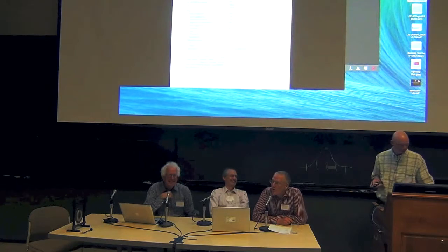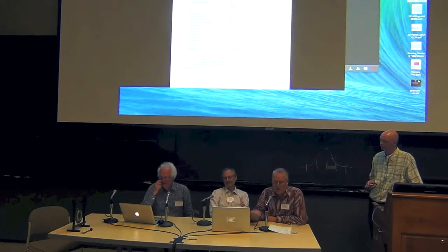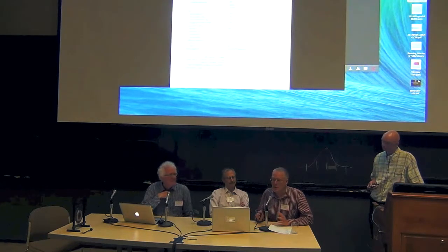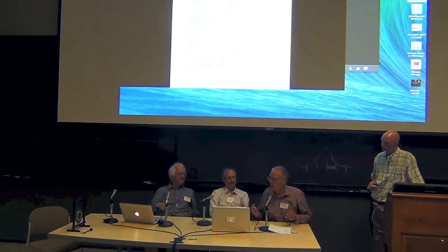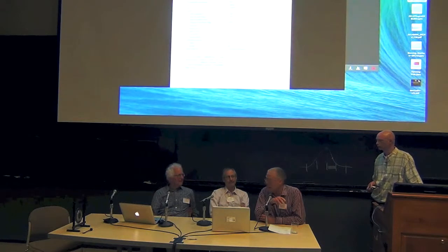I have one more point. I think we'll have to live with the PDB for now, and we can think about all different kinds of additional indicators, as Zbyszek said, informativity of reflections. I don't know what he means, but there are probably good ideas around. The one possibility we have to come up with good ideas and use them for the data that we have now, or in the future, is to deposit unmerged data with the PDB.